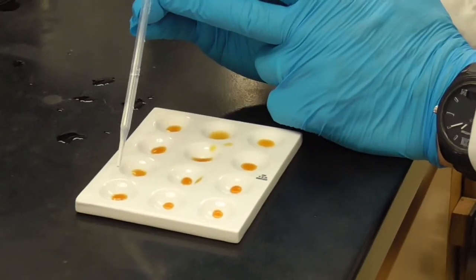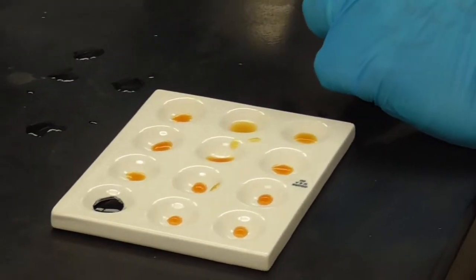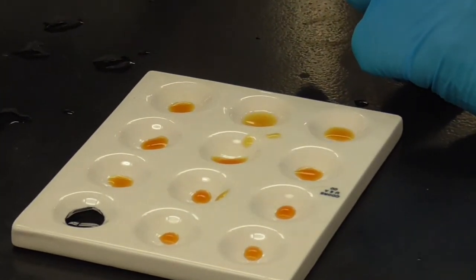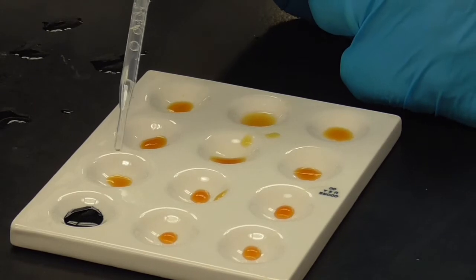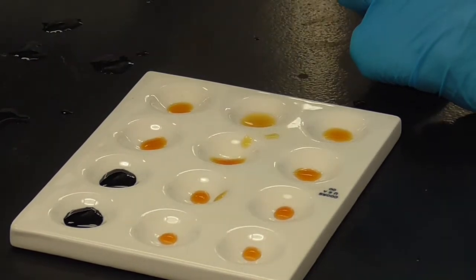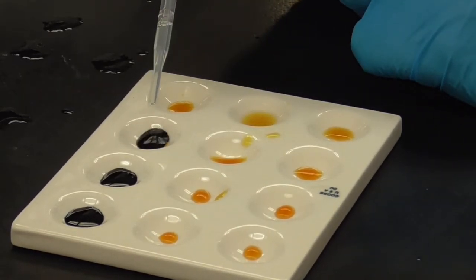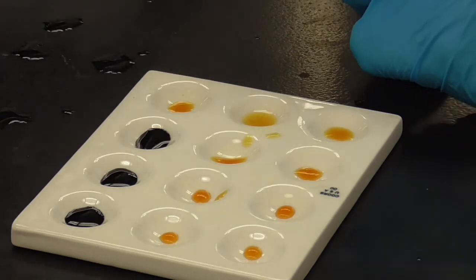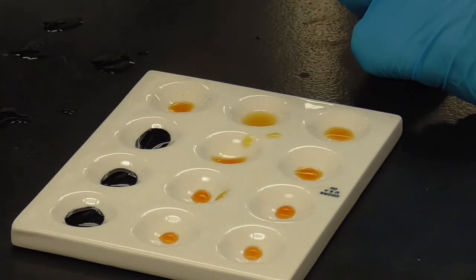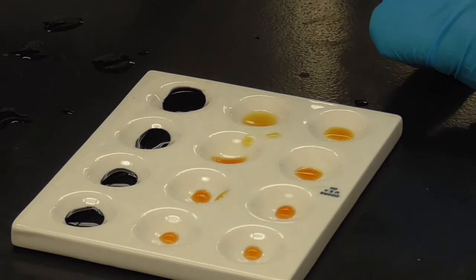Now 4 drops in each one of these, and I'm going to go right across the top row. Here's the one with nothing, no enzyme. 1, 2, 3, 4. Cool. I'm going to do a drop each time here. The one with a little bit of enzyme, the 2 drops of the enzyme. 1, 2, 3, 4. I'm going to leave those in there. The one with the 4 drops. 1, 2, 3, 4. Now what's interesting about this is, wow, they're all the same so far. Here's the one with 6. 2, 3, 4, 5, 6. So they're all the same color at this point.